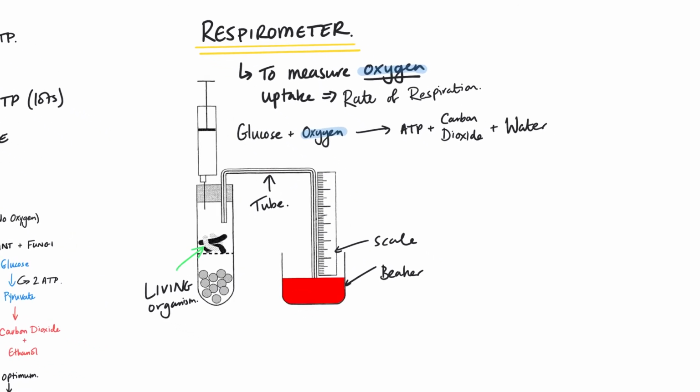They are placed on that dotted line there, imagine it's like a metal mesh where there's holes where gas can pass through really easily. Below that, there's some beads. It might tell you that they're sodium hydroxide beads, or it could just tell you that it's a chemical bead. The point of these is to absorb carbon dioxide out of this experiment. The purpose of the chemicals in these beads is to absorb carbon dioxide.